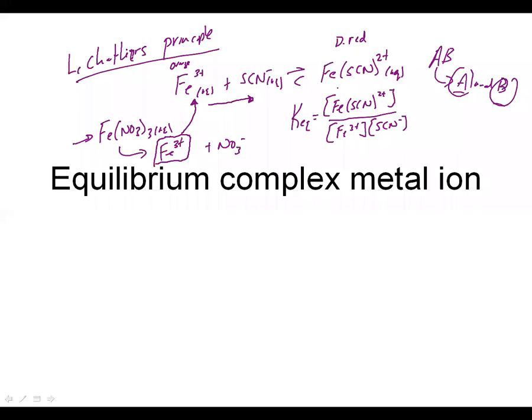Obviously, you should be making observations of what you see in those pictures. And like I said, there's a file, I think, to use as notebook pages if you want. So you could use that if you like. Any questions on the first part here? Really the first part is a lot of what we were talking about at the end of that chapter, Le Chatelier's principle and shifting to the left, shifting to the right.